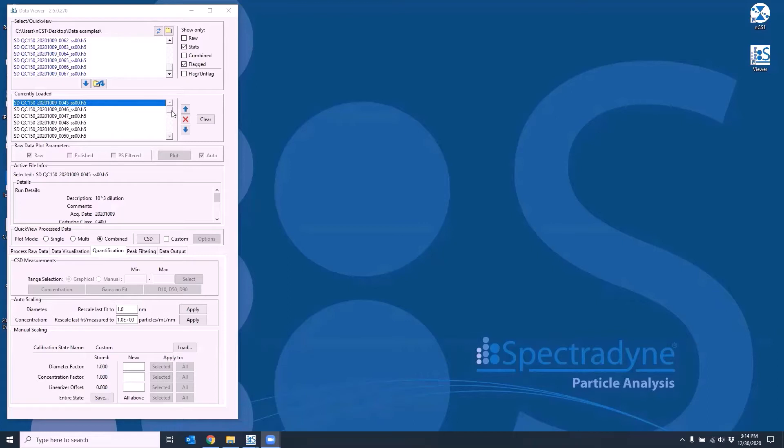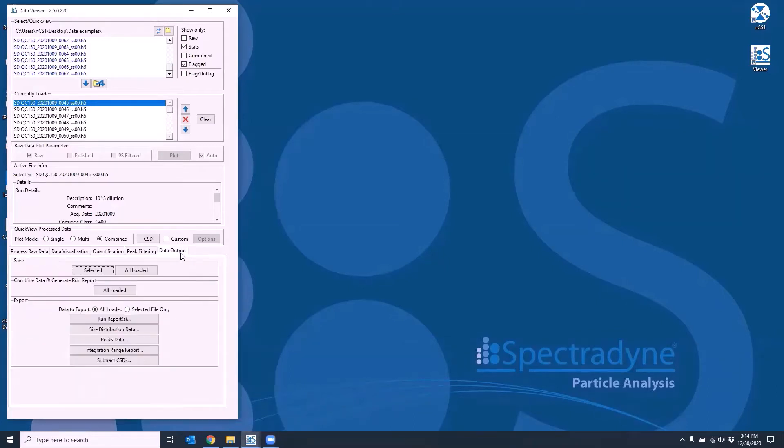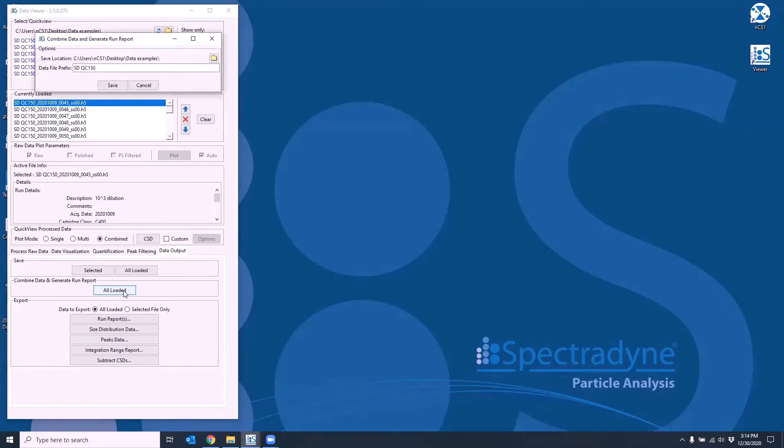So let's navigate over to the data output tab. Under combine data and generate run report, select all loaded. This will combine all the loaded files and also generate a one-page run report in Excel format.